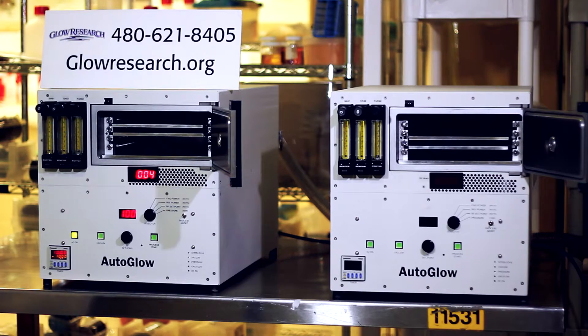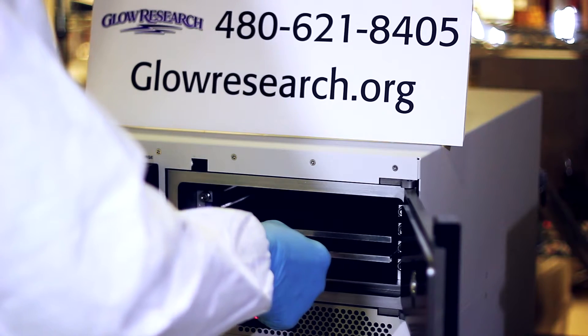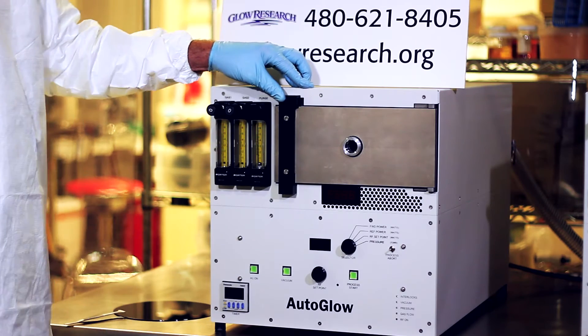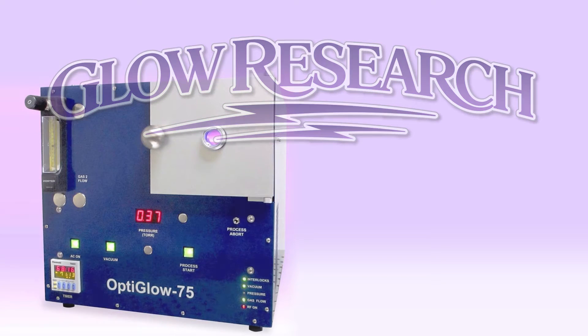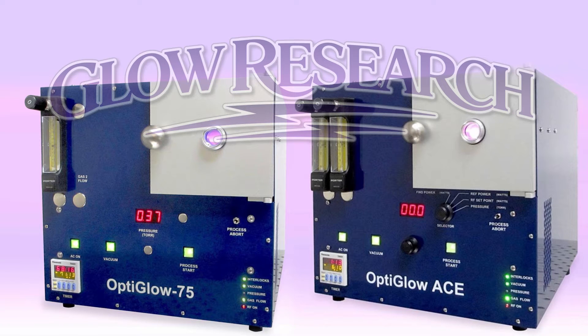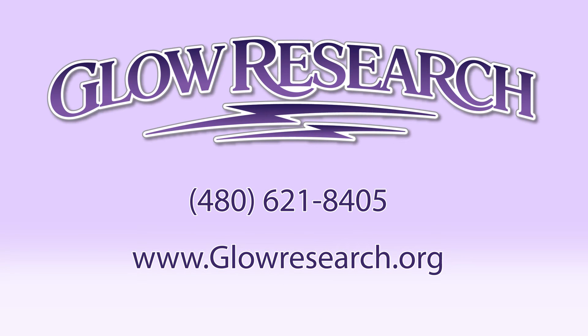A larger chamber is also available to accommodate 8 inch wide by 15 inch deep samples. In summary, the Autoglow 200 is a very durable and reliable plasma system used in labs as well as production applications. Other products manufactured by Glow Research are the lower priced OptiGlow 75 and the OptiGlow ACE system, used for plasma treatment, organic removal, and etching applications. Both have anodized aluminum chambers with powered or neutral electrodes. For precision reactive ion etching, Glow Research now offers the ST1200 for RIE etching of oxides, nitrides, and other films. This single wafer system can accommodate up to 200mm wafers and comes with sophisticated processing software for advanced etching.